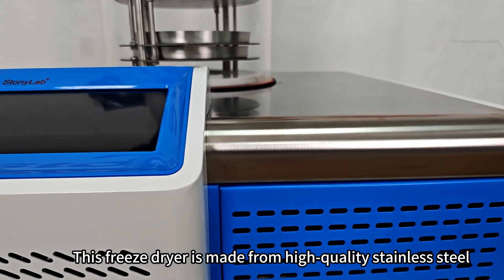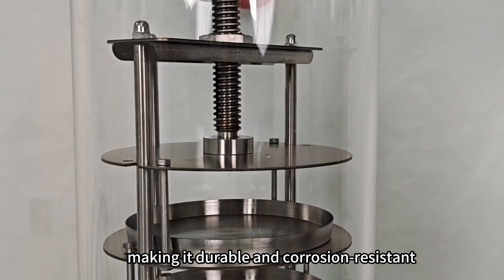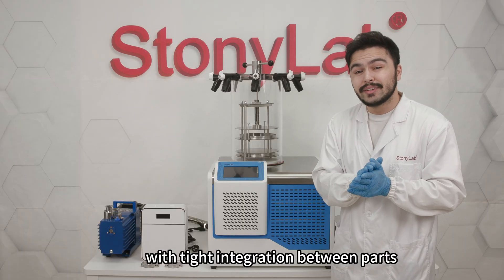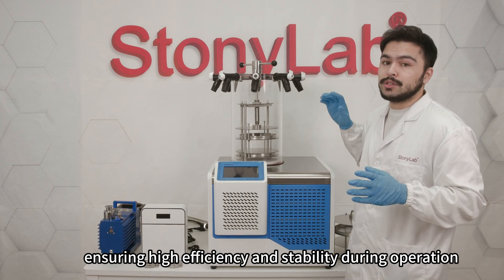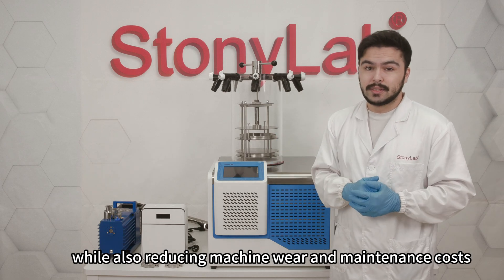This freeze dryer is made of high quality stainless steel, making it durable and corrosion resistant. Its internal components are precisely assembled with tight integration between parts, ensuring high efficiency and stability during operation while also reducing machine wear and maintenance costs.